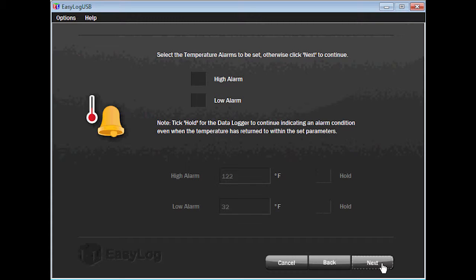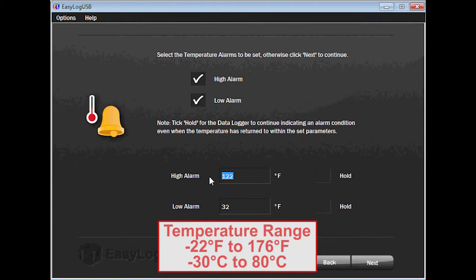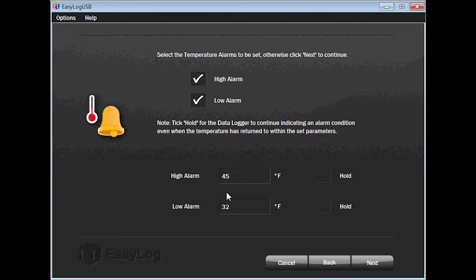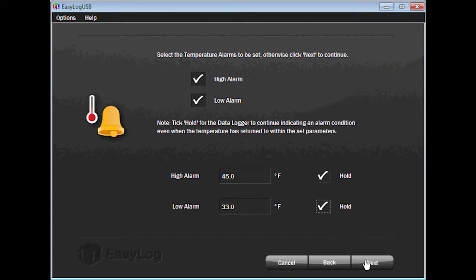Select the temperature alarms you would like to set — either high, low, both, or none. I will record both. Now type in the values for the temperature alarms. The temperature range is negative 22 degrees Fahrenheit to 176 degrees Fahrenheit, or negative 30 degrees Celsius to 80 degrees Celsius. I will make the high alarm 45 degrees Fahrenheit and the low 33 degrees Fahrenheit. Now that alarm values are set, you can choose to check the hold box if you wish the data logger to report there was an alarm condition even after the temperature has returned to the set parameters. Click on Next to continue.